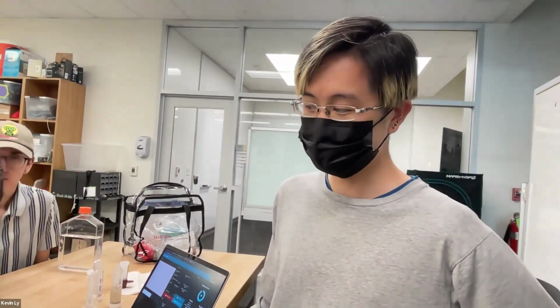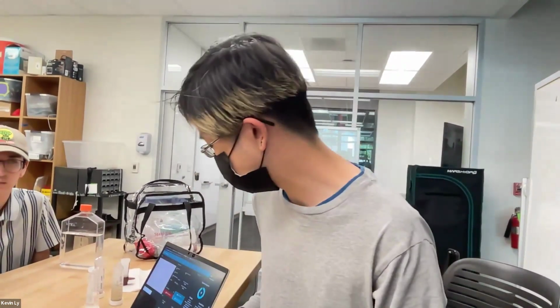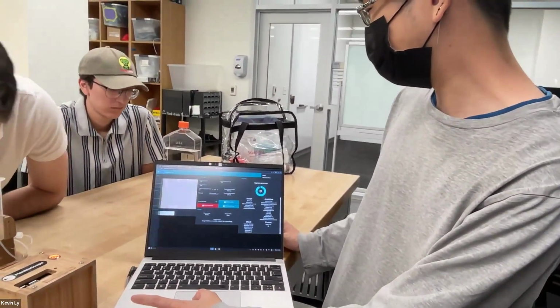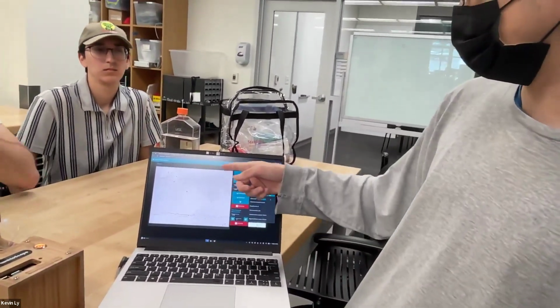Oh, yeah. Could you explain how the segmentation works in this? Is that AI based, or how does that work exactly? What exists right now is not very sophisticated. Basically, it's a Python program which uses OpenCV. It does some background subtraction because the image here is kind of dirty right now. I need to clean the flow cell, but you see there's stuff that is stuck.